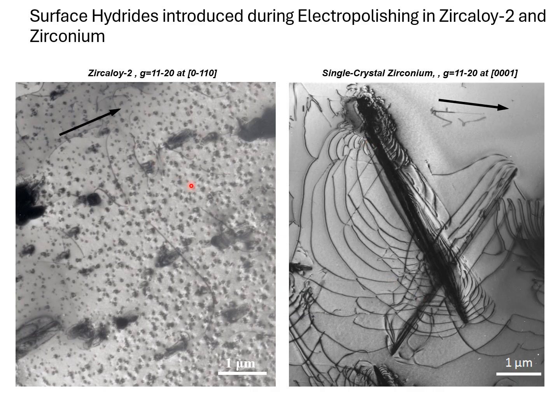So although the left-hand side, zircaloy, is ostensibly under the same conditions, room temperature foil preparation, you don't see as much evidence of this deformation in this particular case. That can be attributed to the fact that the zircaloy itself is much stronger. The matrix has a lot of tin in solution, and is much stronger.